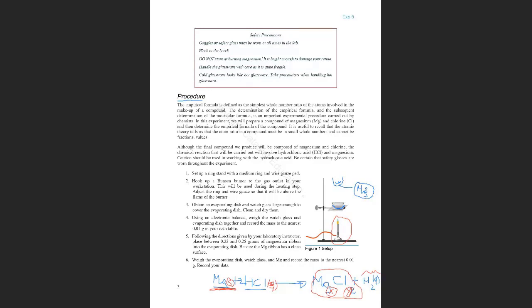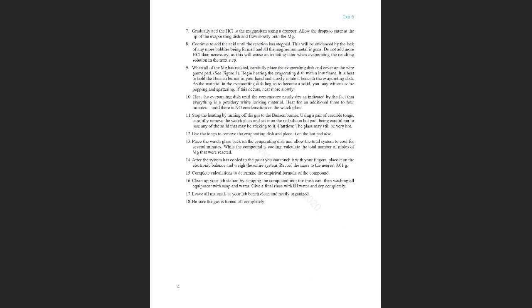So then you wait until it cools down, because we cannot use the balance if we place on the balance anything that is hot. It has to be at room temperature. We wait until everything is at room temperature, and then we are going to record the weight of the compound. So this is all it is, the experiment today.